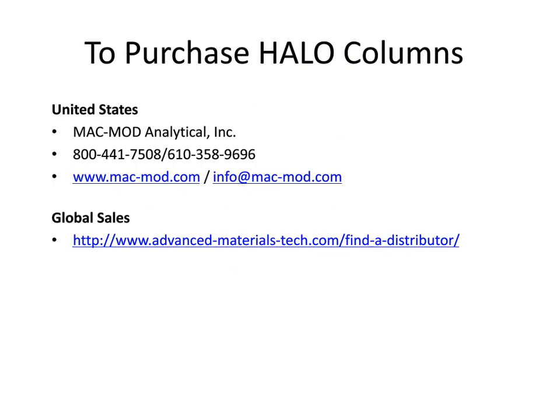Our first question for Dr. Boyes. What challenges did you run into when using columns with 0.2 millimeter internal diameter? Was the HPLC system suitable in terms of minimum dispersion?